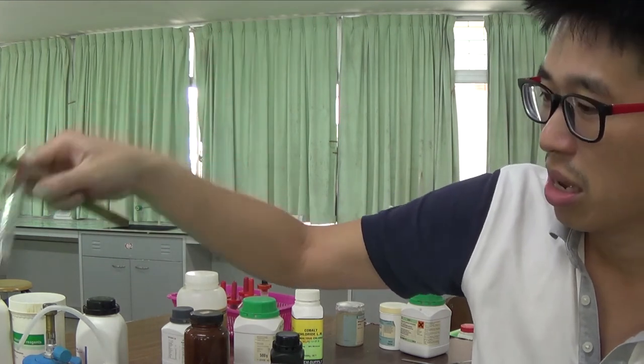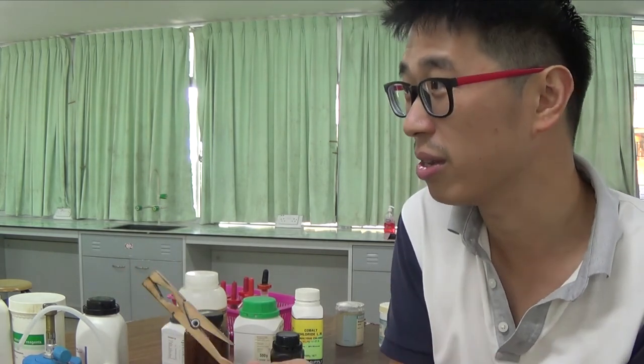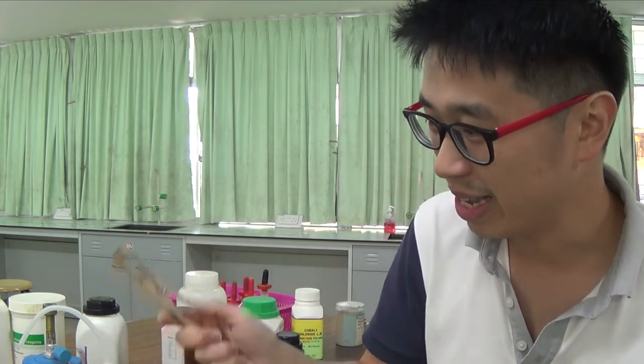So sometimes, after you heat them for too long, if the color doesn't go back like the cobalt here, it probably means that the compound decomposes. Because if it doesn't decompose, it should give me back what I started with when I add water. But if it decomposes under heat, it turns into something else, which means that when something is decomposed, it's gone. When an animal body decomposes after it passes away, you don't get the body back again, all right?